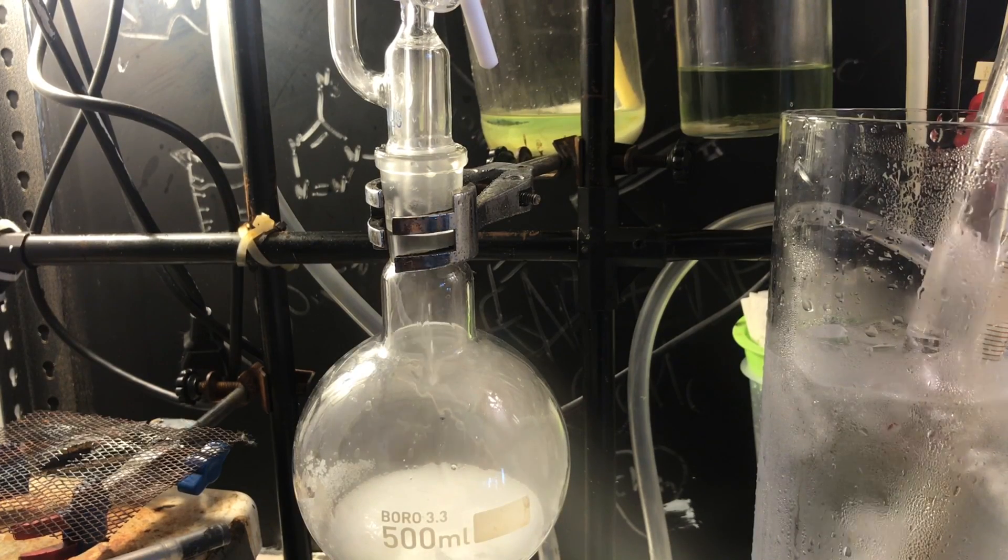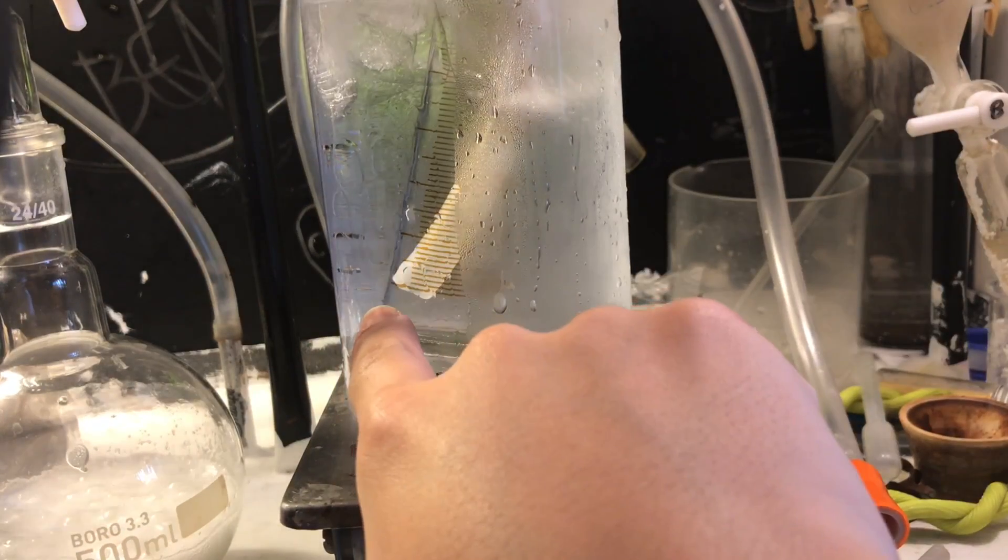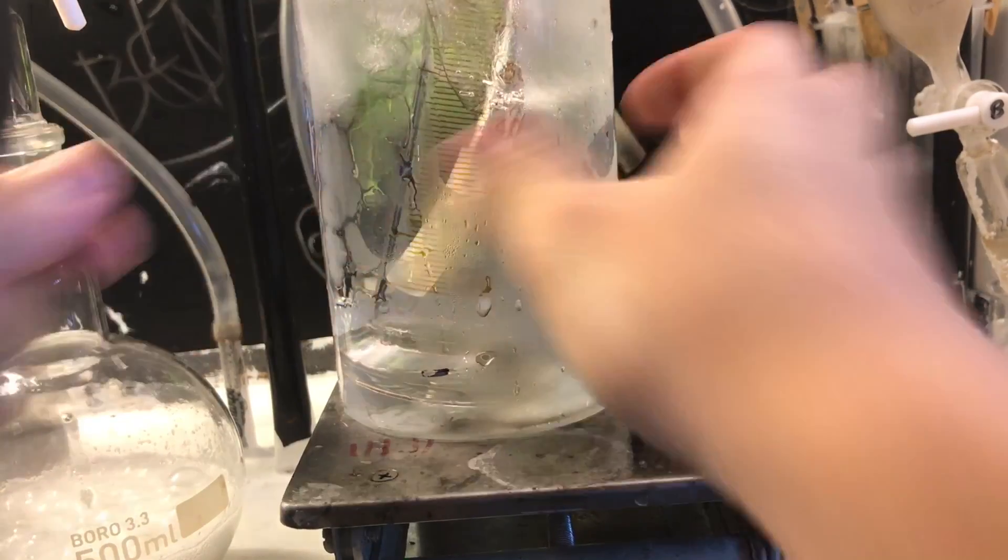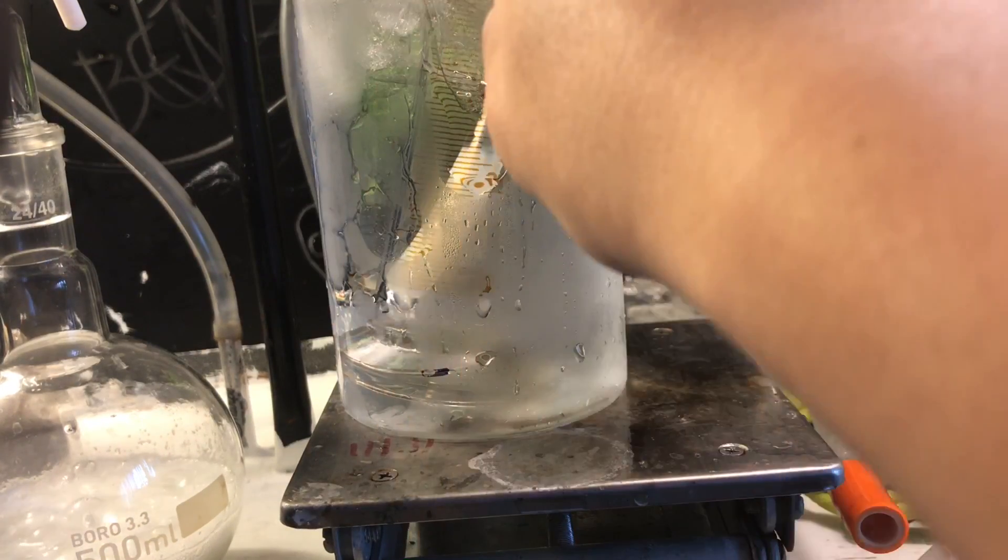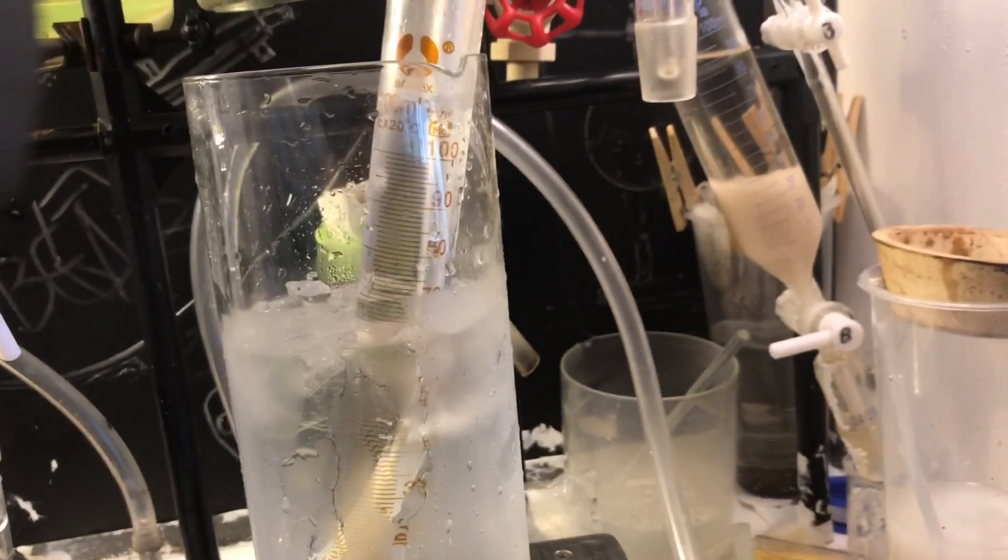You can see we get a mist of HCl gas, and that's due to water. Once the air is purged out, you see the bubbles start dissolving into ice water, and that's our hydrochloric acid forming. Basically, it's the HCl dissolving.